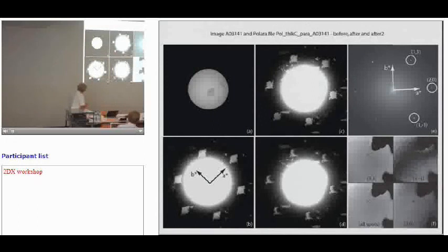Here is the calculated diffraction pattern. Now let me just get this right. So this is before we took the high resolution image. You can see it's nicely illuminated, and this is the high resolution computed diffraction pattern. And this is the electron diffraction pattern taken, before and after that image was taken. And you can just see where the beam is circular, and you can see the edge of it in that spot. And it's actually in all of them.